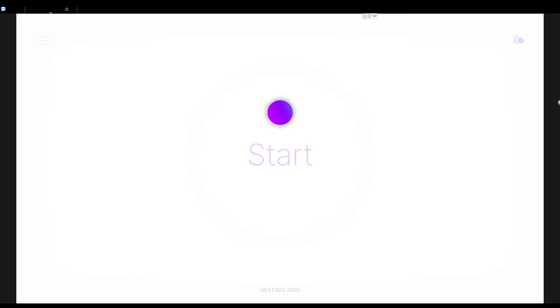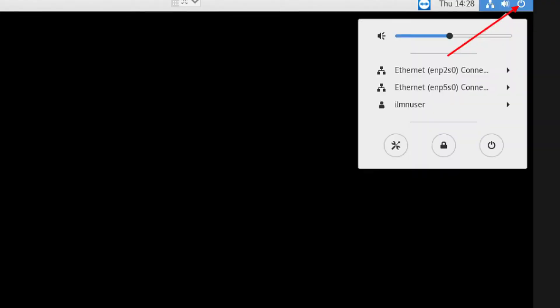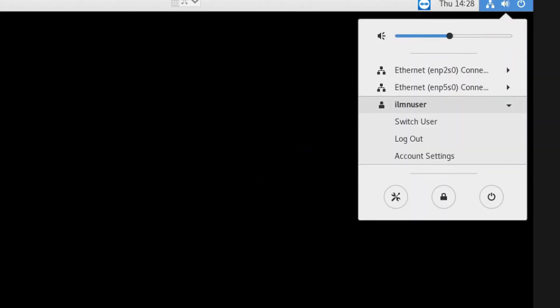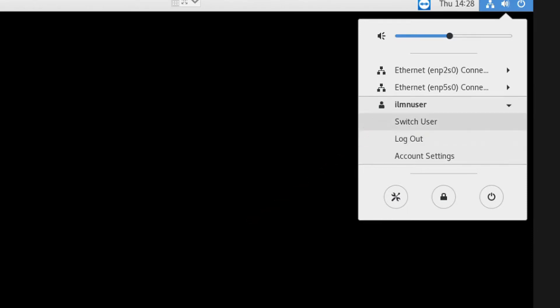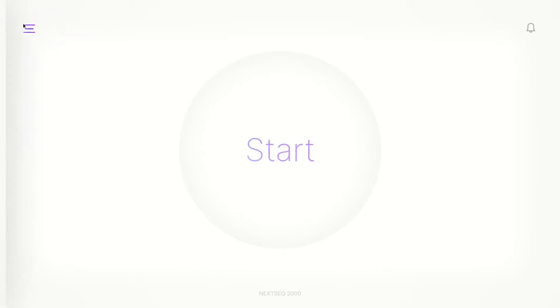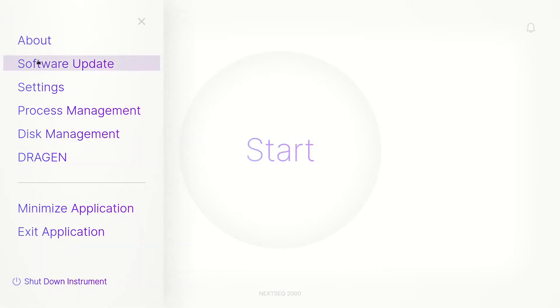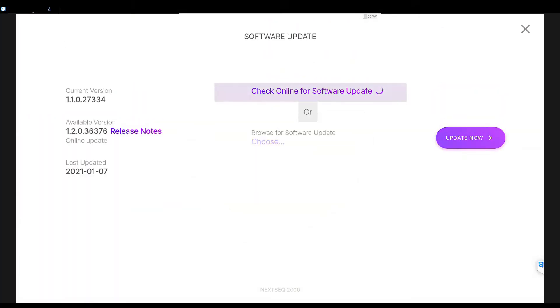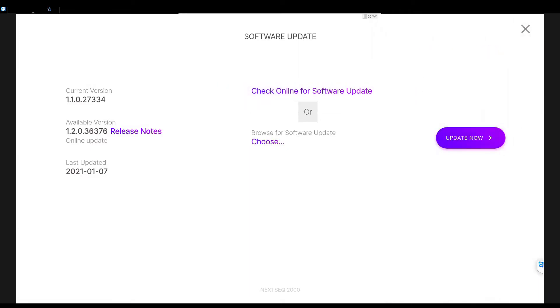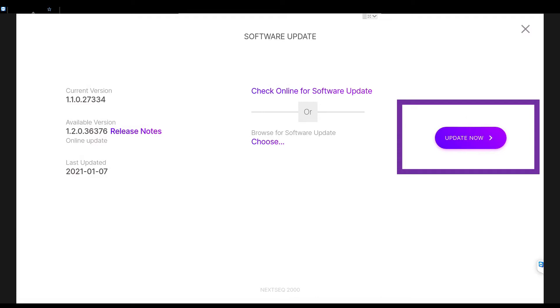If you are logged into the Illumina user account, sign out and switch to the Illumina Admin. Next, from the Control Software home screen, select the menu icon in the top left corner. Then select Software Update. Now click Check Online for a Software Update, then Update Now.